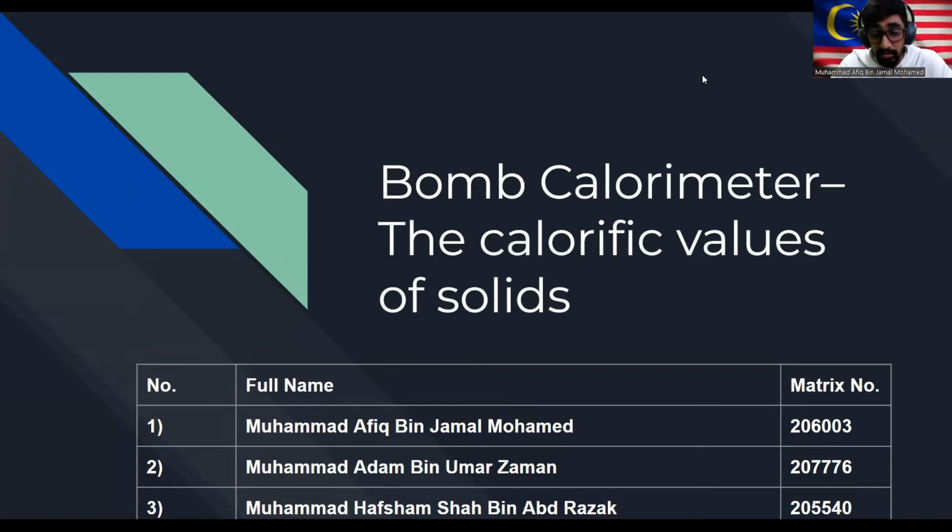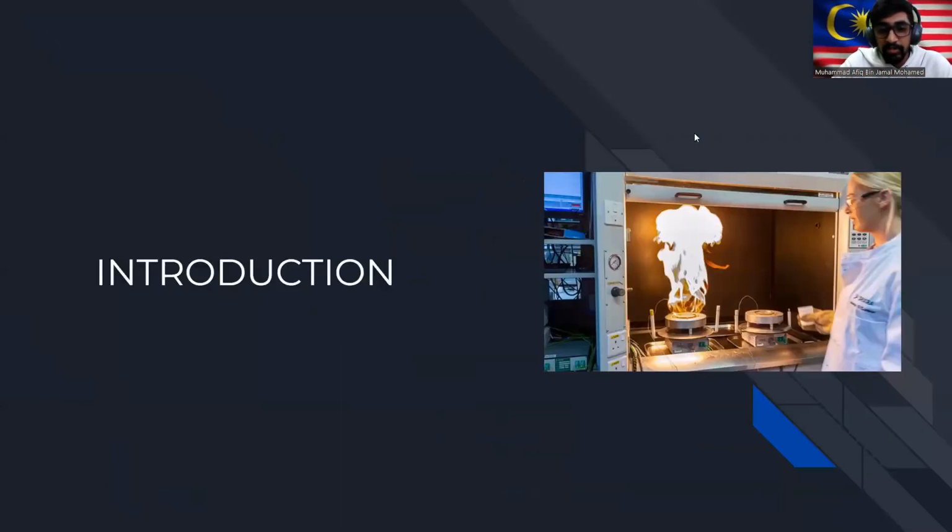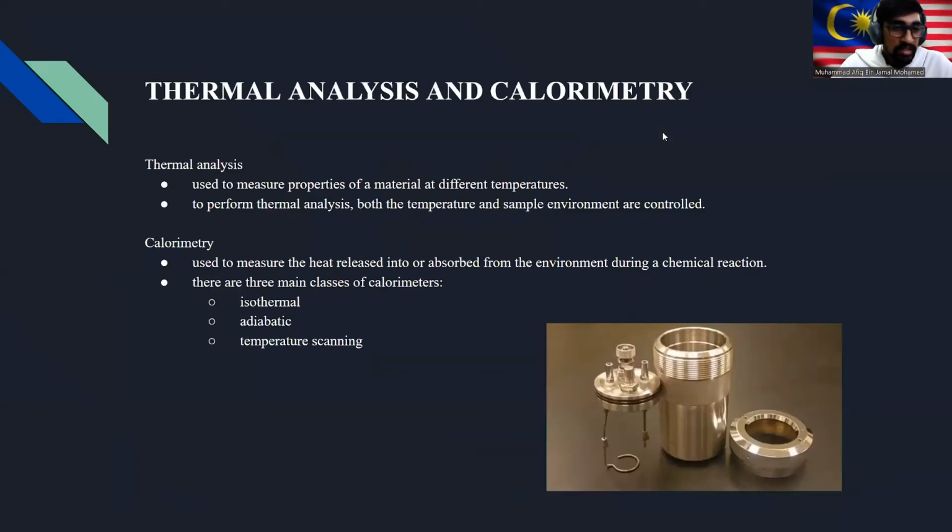So today, me and my group are going to present about the bomb calorimeter, the calorific values of solids. So before we proceed, let me just give you a short introduction of our topic. So we must first understand what is thermal analysis and calorimetry.